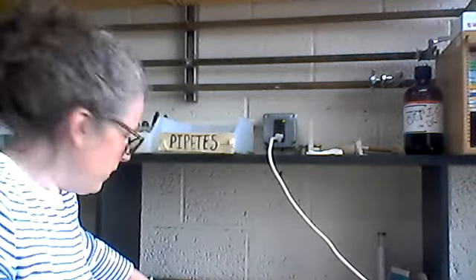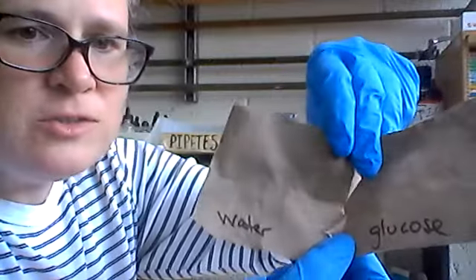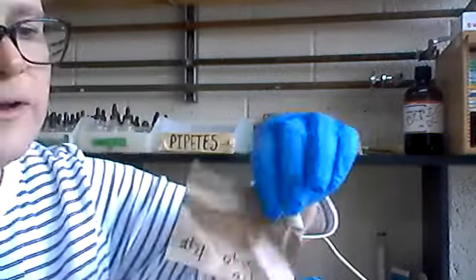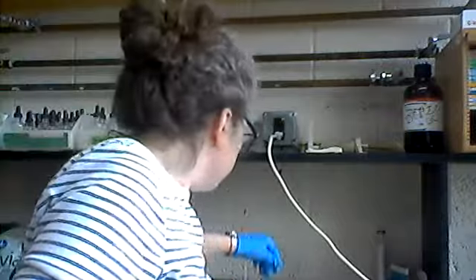Now, before we finish, we're going to look at our results of our paper test. I'm just going to show a few. So the water, it's completely dry, glucose completely dry, much like we would expect. If I skip over to the olive oil, this is dry, but you can see, if you hold it up into light a little bit, you can still see that kind of grease spot, which we're all kind of familiar with from life anyways. So I'll take photos of all of this stuff. I'll get it all posted on Canvas for you, and you can use those as the results for your lab manual assignment this week.